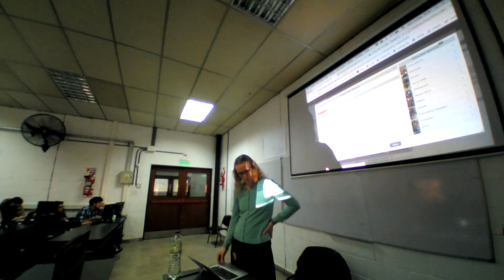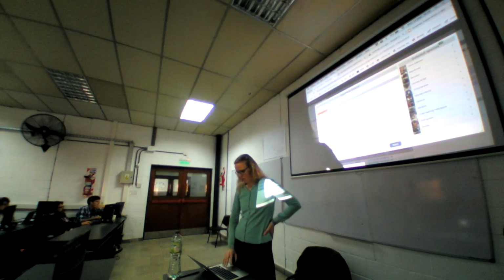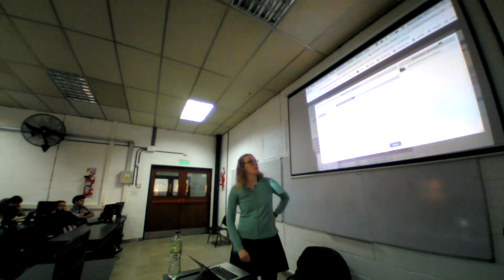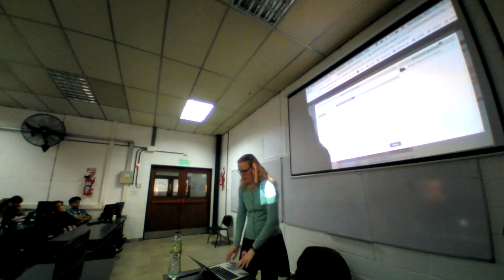I will do a pairwise alignment with mouse and human now. So I will click through pairwise and then rodents, rats and mice to the mouse reference genome and select that. What I've selected is shown on the right hand side, and now I can click apply.